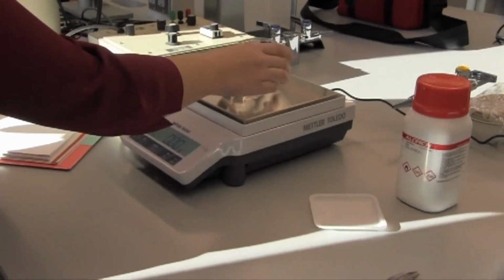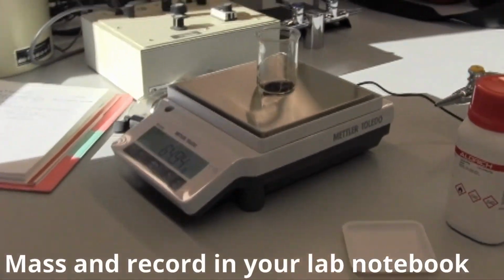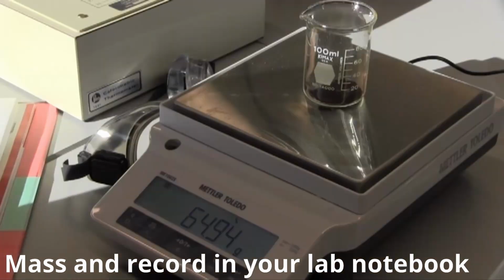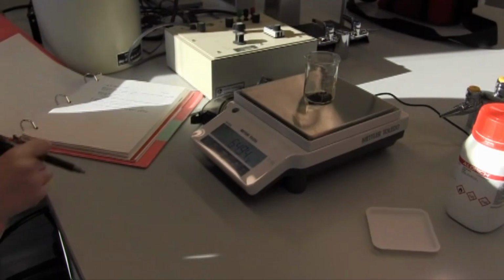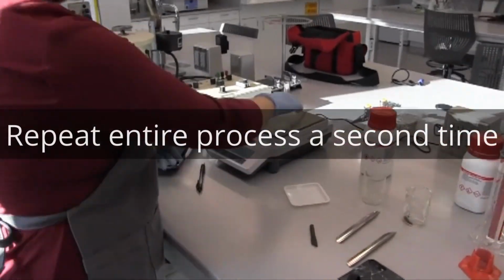Once the copper has cooled to room temperature, take the mass and record in your lab notebook. Now we will repeat the entire process a second time.